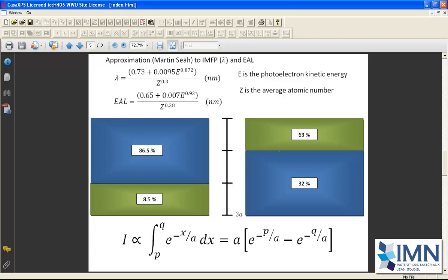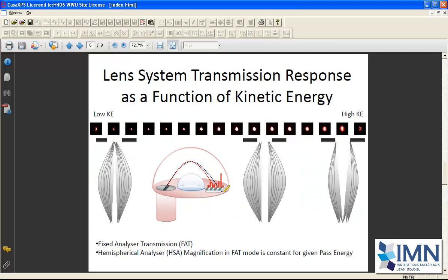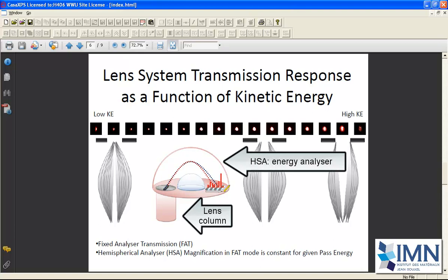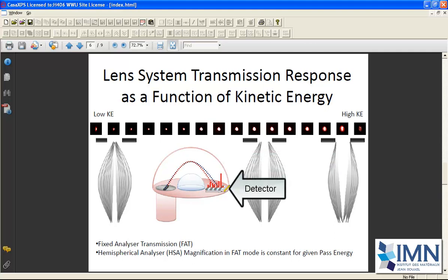The next thing to consider in terms of what alters the intensity of an oxygen 1s peak is how the instrument and the energy analyzer functions in conjunction with the lens system. When we perform a measurement using a fixed analyzer transmission, or FAT mode, we specify a pass energy for the hemispherical analyzer. And this means that all the electrons that may come from a range of different kinetic energies from the sample must be retarded to this pass energy if the electrons are to pass around the analyzer and be detected.